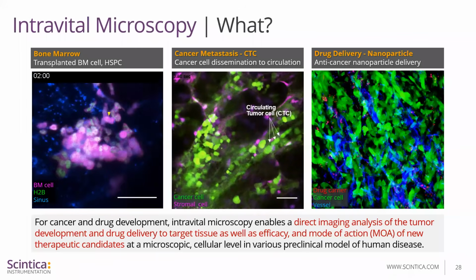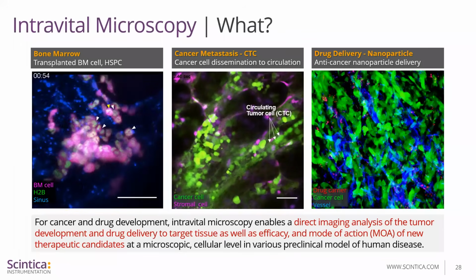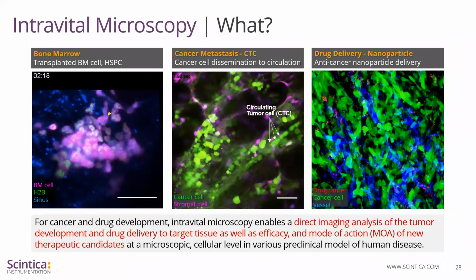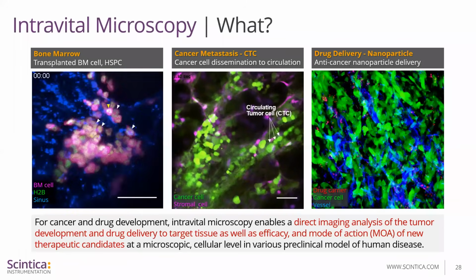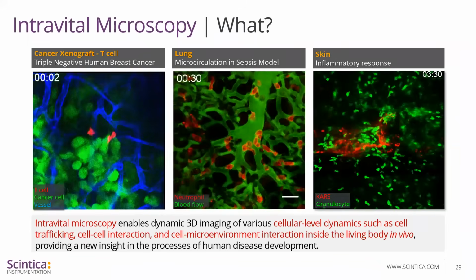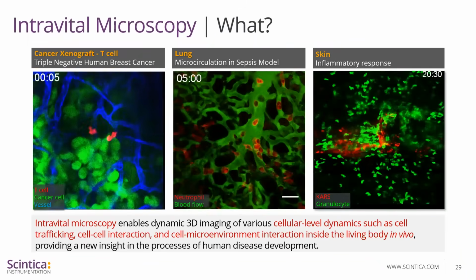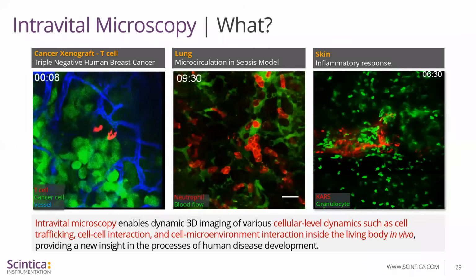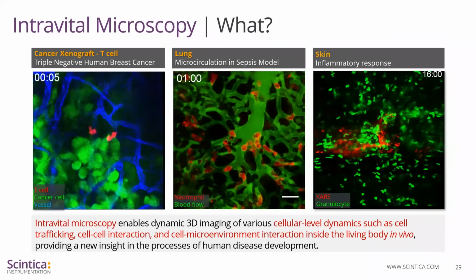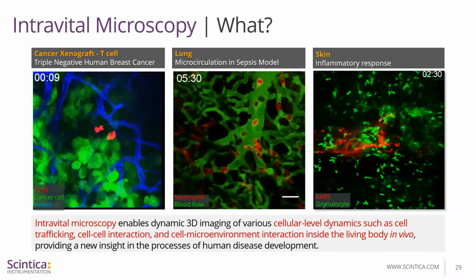Once you have established, optimized, and characterized your intravital imaging model, however, its applications are pretty much endless. You can apply it in stem cell biology, oncology, drug development, immunology, infection, and inflammation, allowing you to study cell-cell interaction, cell trafficking, and cell-microenvironment interaction, in vivo and over time.